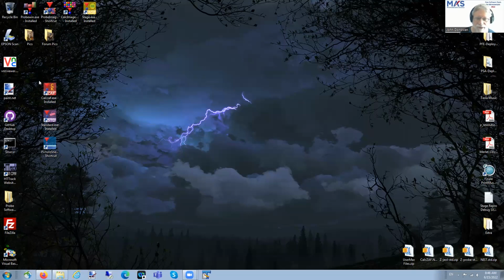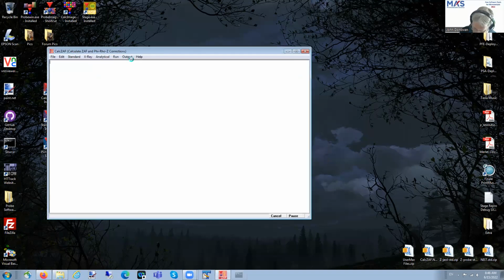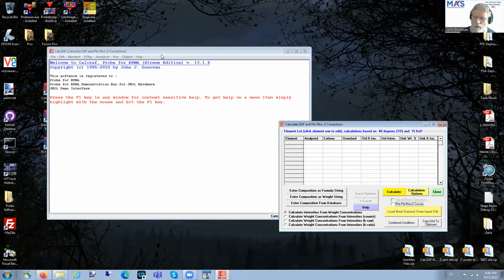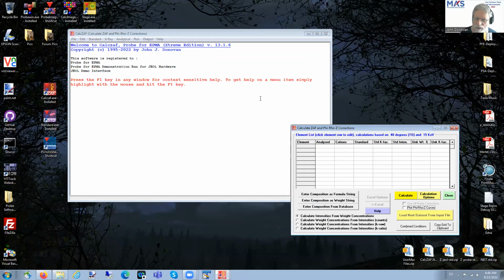And a little bit of history. CalcZAF was, back in the day, when we were developing and comparing some of the different models for matrix corrections, and working with Paul Carpenter and John Armstrong at Caltech. John started with first documenting most of these corrections, and so he had something called CIT-ZAF, which was California Institute of Technology ZAF, and then he had a TRI-ZAF, which was to try all the different matrix corrections.